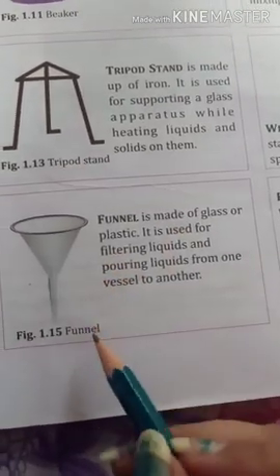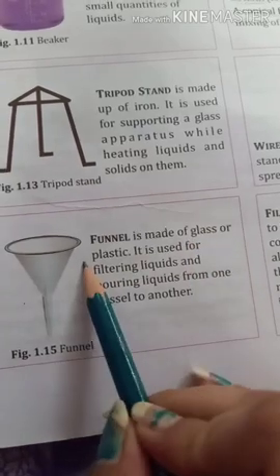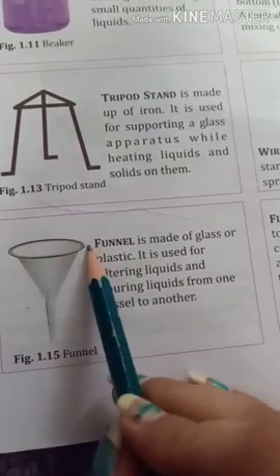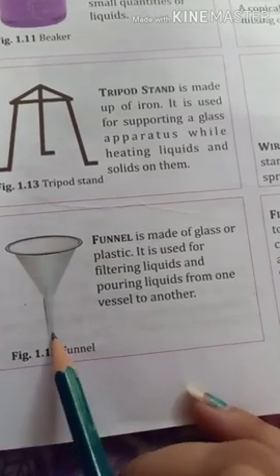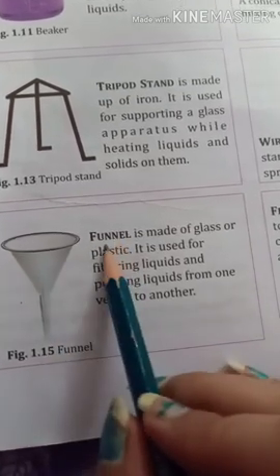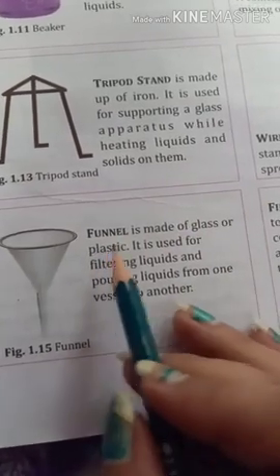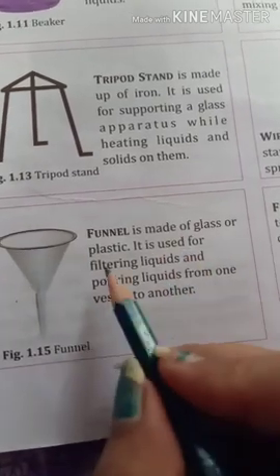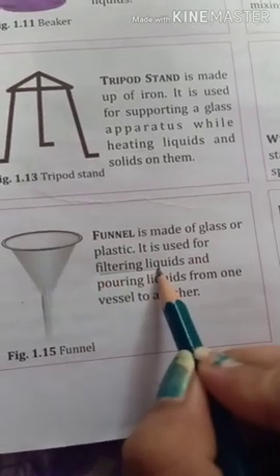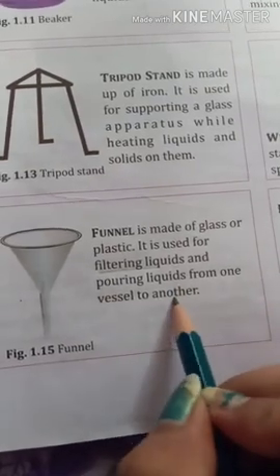Next apparatus is the funnel. Funnel is made up of glass or of plastic. This is a funnel. From this side it is round, and from this side it is narrow, and this funnel is made up of glass or of plastic. And the main use of the funnel is filtering liquids and pouring liquids from one vessel to another vessel.